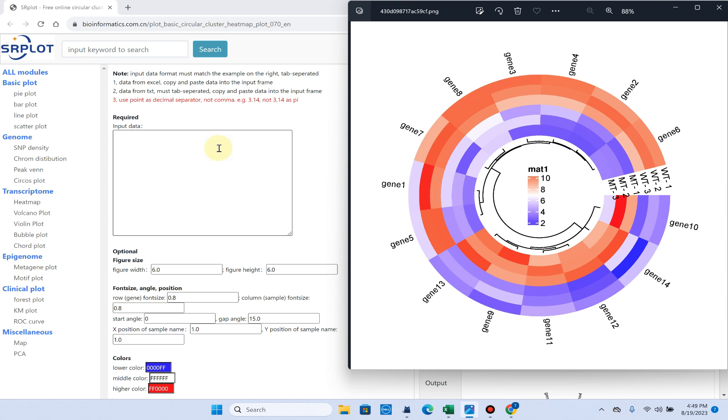I will show you how you can prepare your input data to draw the circular heat map for your gene expression data or fold changes data.